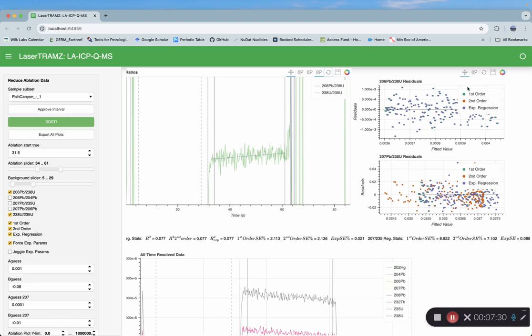What you really want to avoid are curvature artifacts where you have a bunch of residuals down here and then up here you get a bunch of residuals and then it'll curve down, convex or concave, right? Basically what that means is that your regression is poorly describing the actual data. It means there's an extra regression parameter that's needed in order to appropriately approximate the data that you're regressing.